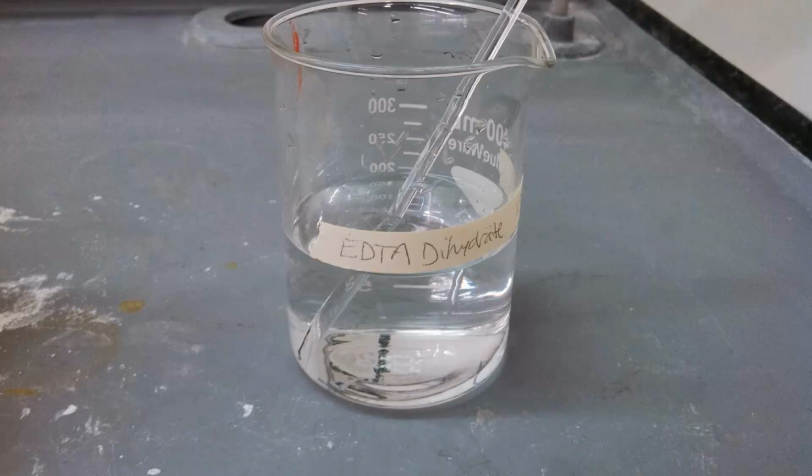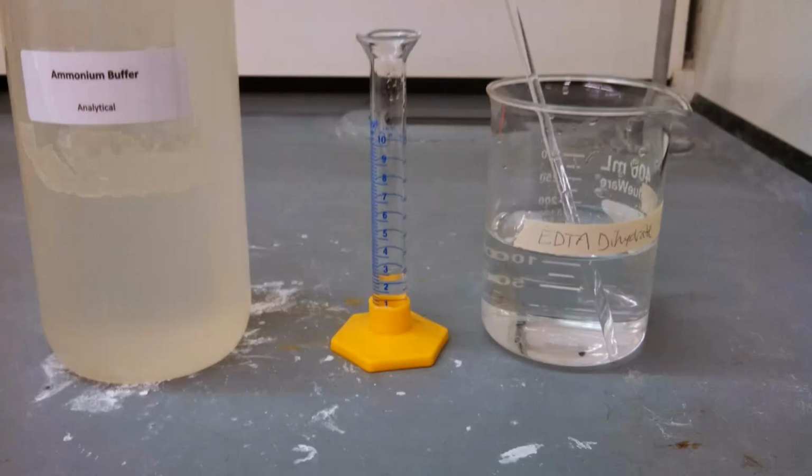The first thing you're going to do in your experiment is make the EDTA solution. So you're going to weigh out some EDTA, dissolve it in deionized water, and then add ammonium buffer. This is how we're going to control our pH, and we're going to check the pH many times throughout this experiment to make sure that we still have enough EDTA in the correct charge state to give us predictable stoichiometry. To test the pH, you don't just dip pH paper into the solution.